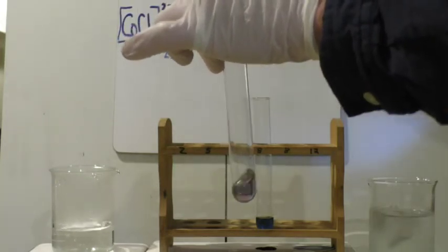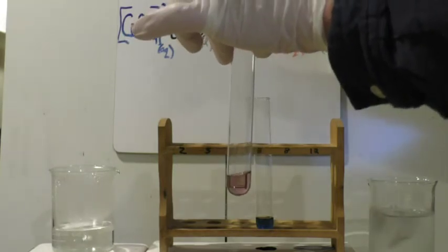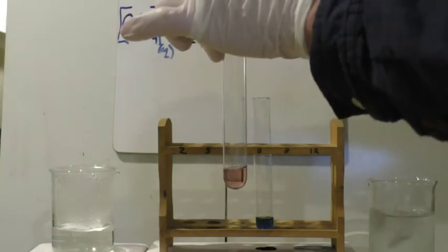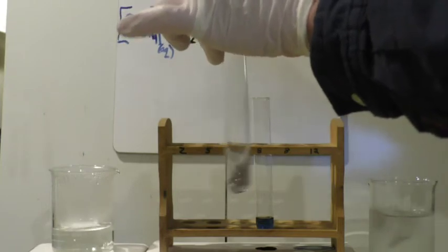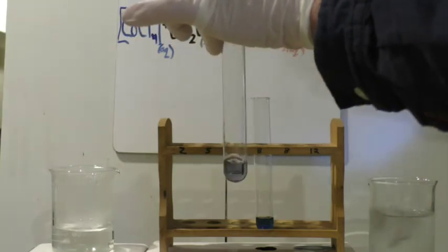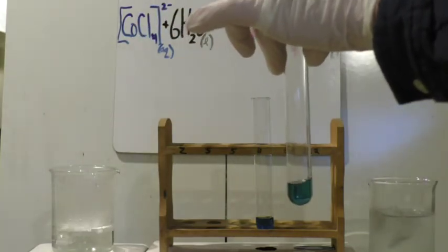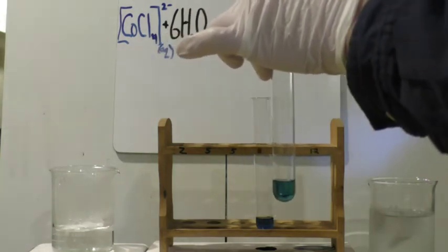I can add some more water. I can drive this all the way to the right. Well, I can just play this game all day. Add some more Cl-. I could also do this by adding sodium chloride, which if I can find some, I'll try and show it to you. But what I'd like to do is see if I can push this pretty far to the left. And I'm going to bring it back just a hair.